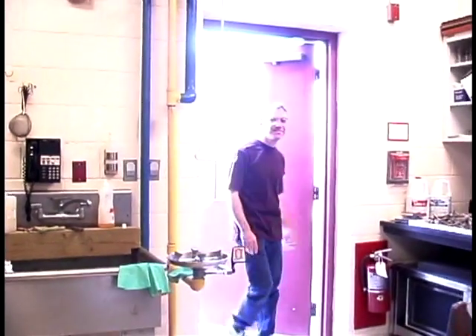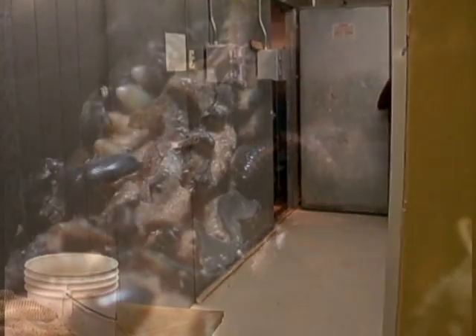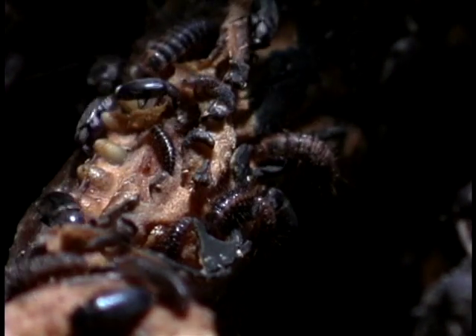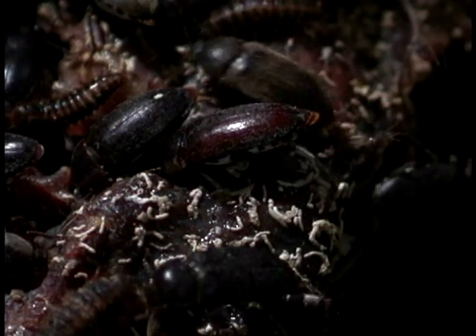Although I'm the person responsible for preparing skeletons, the actual work of cleaning them is done by our colony of carnivorous dermestid beetles. Dermestids are small beetles, about one centimeter long, found throughout the world. They are its super sanitation engineers, cleaning up dead animal and plant material wherever they find it.